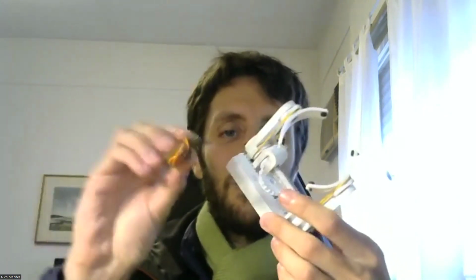Hey, Nico, that plate picker, the hand that you just showed, is that off the shelf or is that 3D printed? Oh no, this is 3D printed. I 3D printed it and I downloaded it from the GitHub repository of BioPic. If you look for BioPic GitHub, let me just search it for you real quick. The models are there. Well, I'm actuating it by hand because the servo I have is too large. It doesn't fit. So I'm only moving it with my hands. But yeah, it works really well.